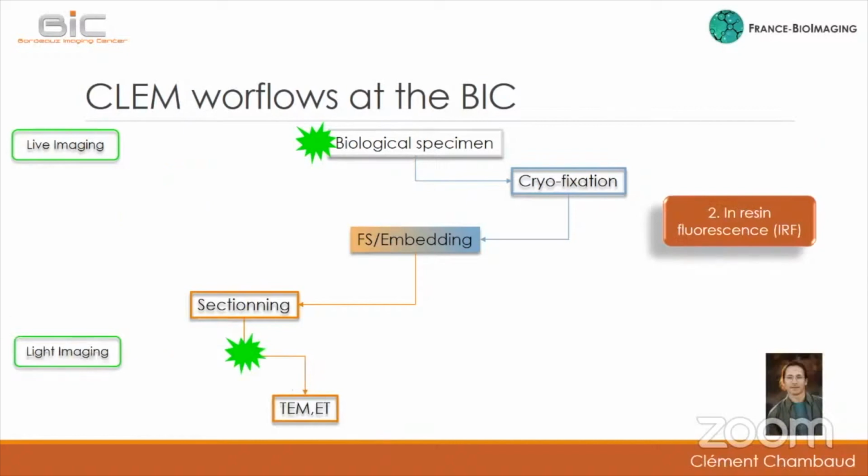Then Clément Chambaud will be explaining the resin fluorescence protocols, where they take advantage of different resins after cryofixation that preserve both fluorescence and immunoantigenicity, so they can observe the fluorescence of these sections before going to electron microscopy and target the region of interest.